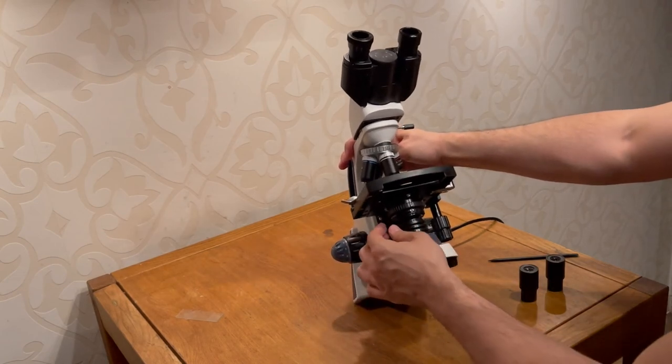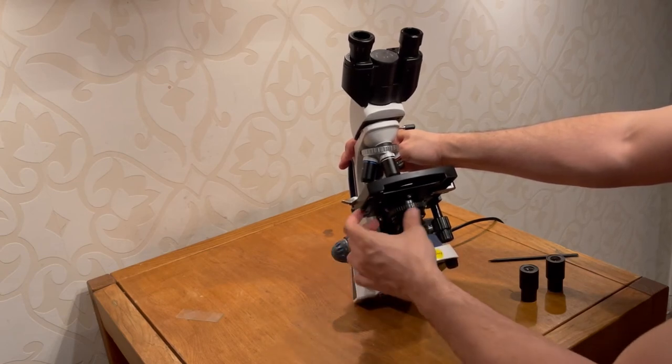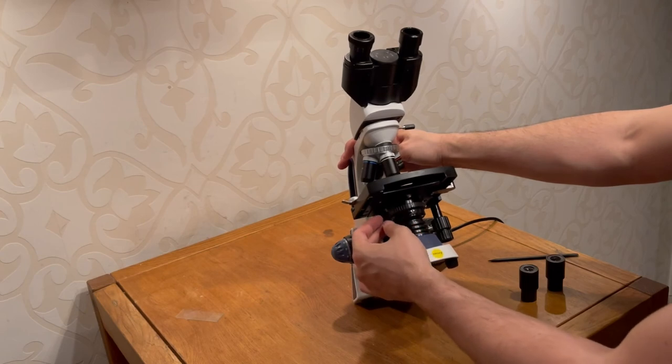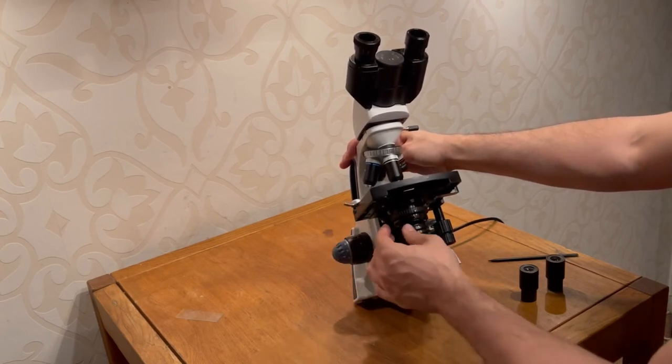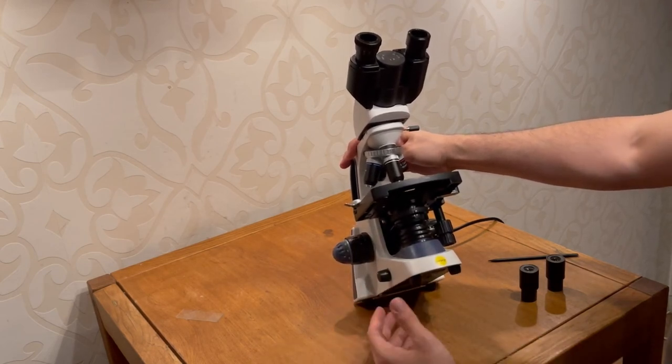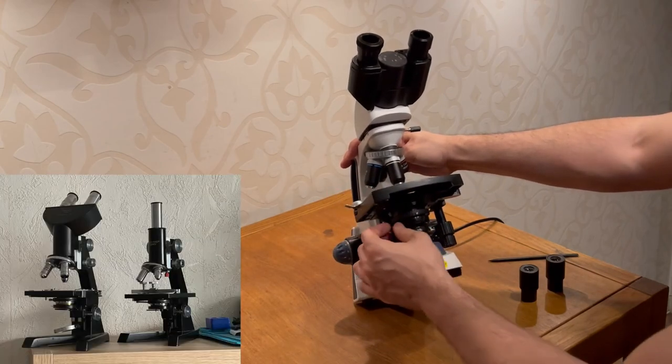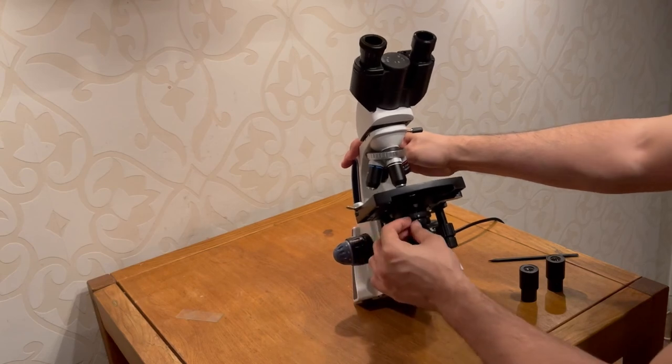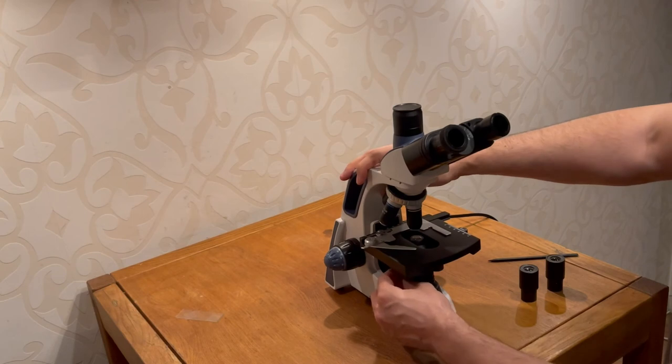Speaking of which, I mean, when you try to adjust it, it's just wobbles like that. It doesn't have any resistance, so to say. It's good and bad. I'm comparing it to the other two microscopes I have. They are high-grade biological microscopes. A bit older ones and all mechanical. I mean, those things, they have quality in it. And all these parts are done with love. It's the Reichert microscopes. Very nice ones.